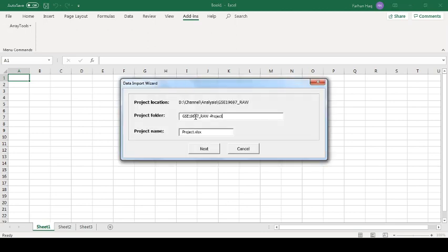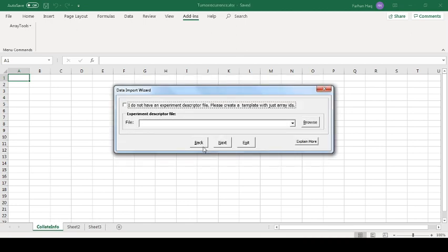Let's see what project folder I want to make. I say test folder, or I can say breast cancer only. Project name should be tumor recurrence, right? Okay, this is the Excel file. I just wrote it. You can name it anyway, whatever you want.